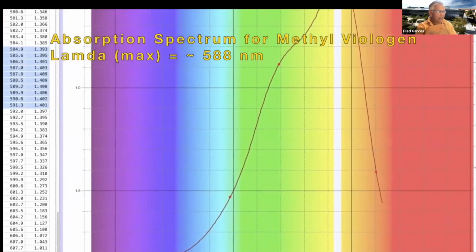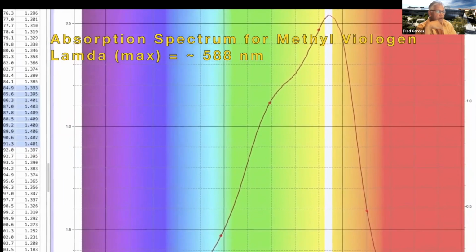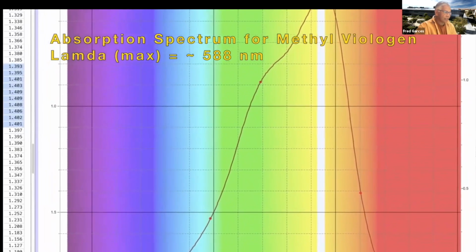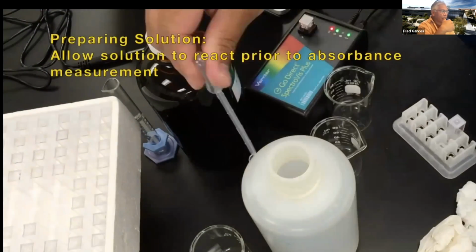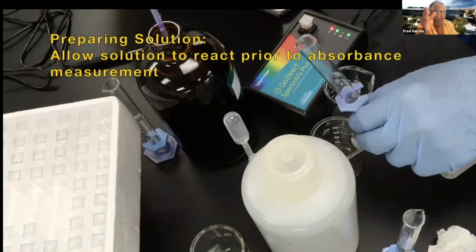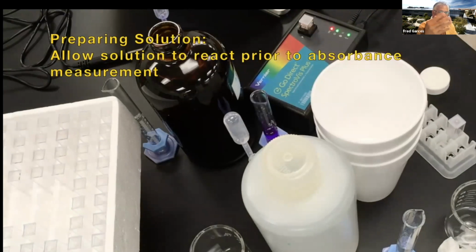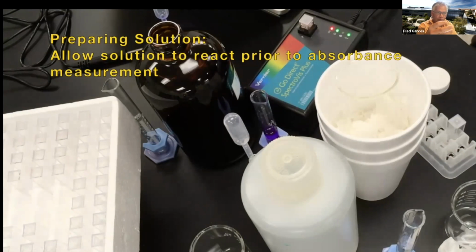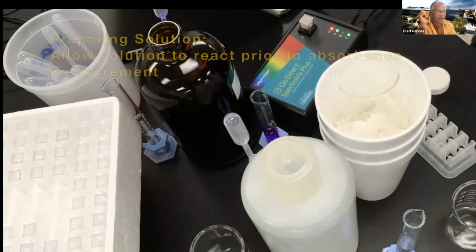And here again is the super slow-mo of what we just recorded. You can see this white bar is the range where I'm going to be sitting, about 588. Now I'm ready to run the experiment. Prepare the solutions, and allow the reaction to react prior to the absorbance reading. You have to let the reaction run a little bit so that it has time to come together. Once you do that, then you can start monitoring it with the SpectroVis instrument.